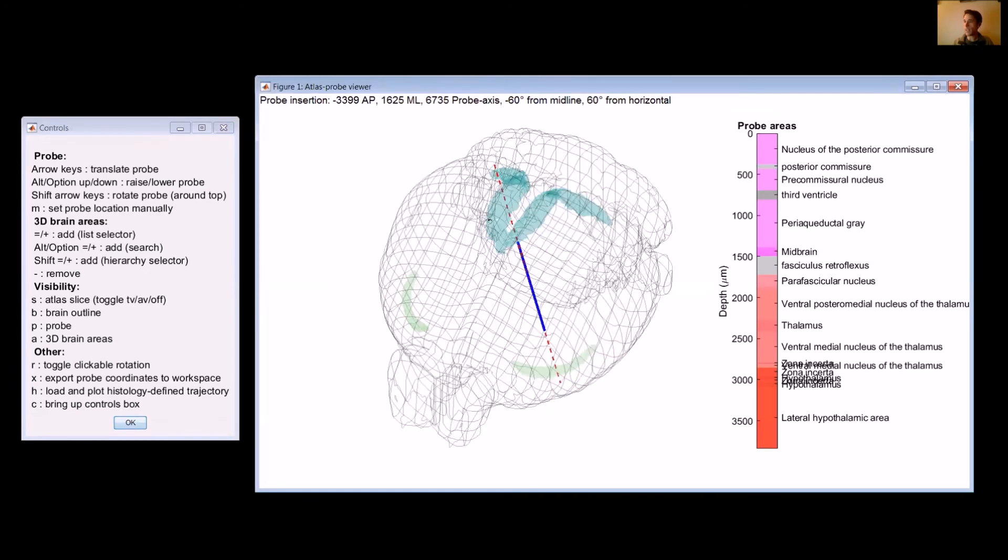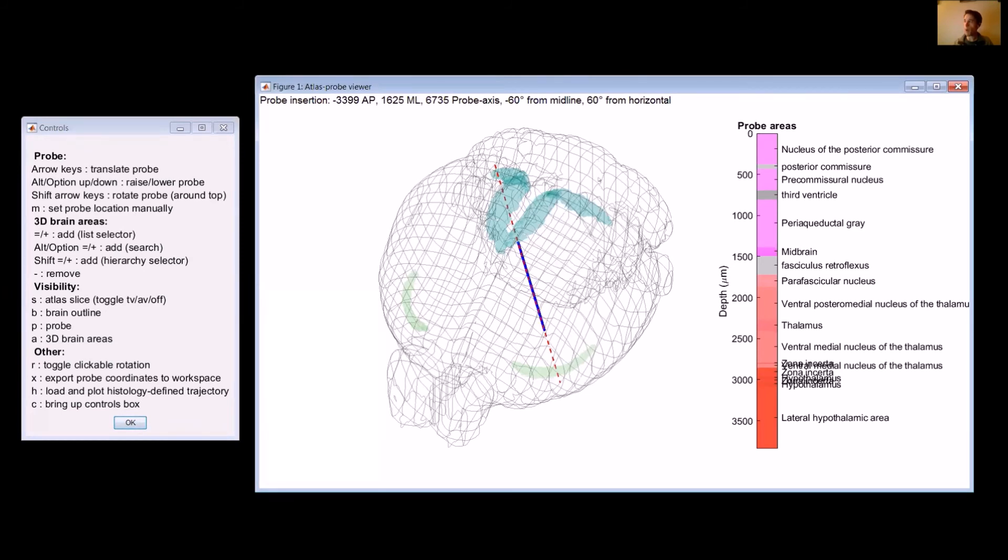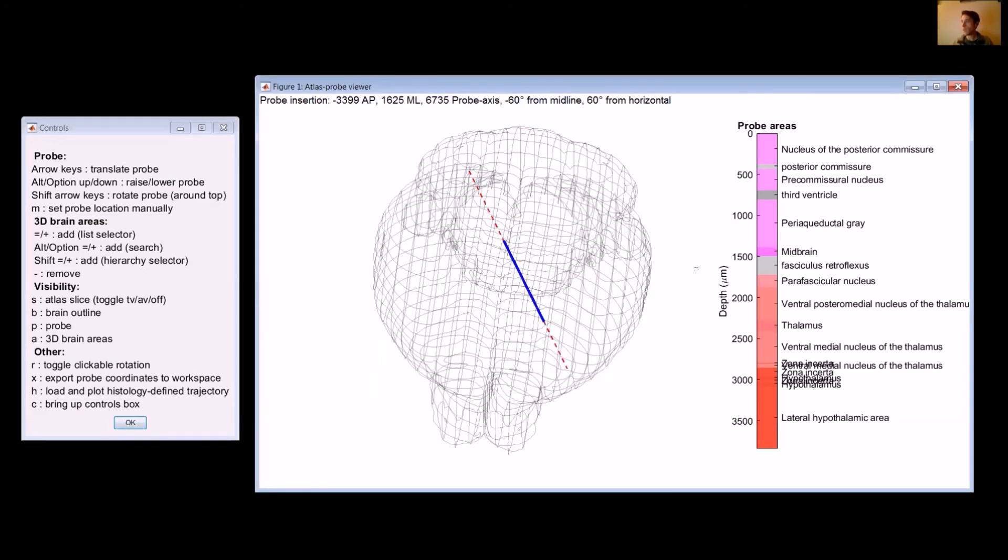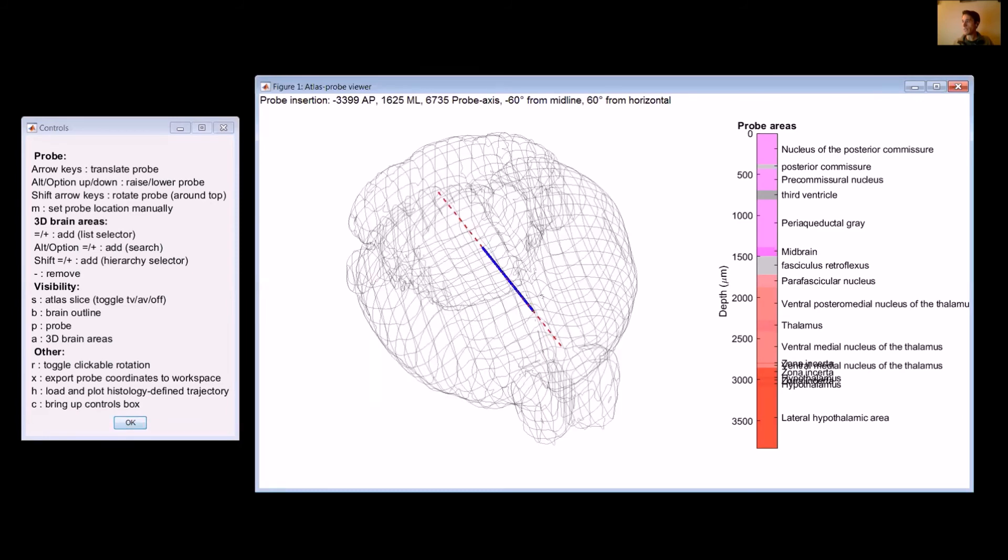If you want to remove, then you hit the minus key. So you'll hit minus. It'll bring up all of the things that are currently plotted. You can select all, and then it gets rid of those things.